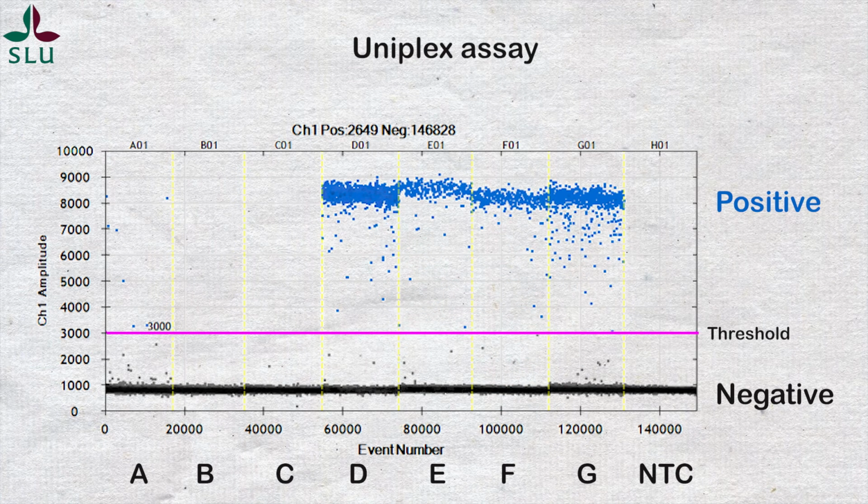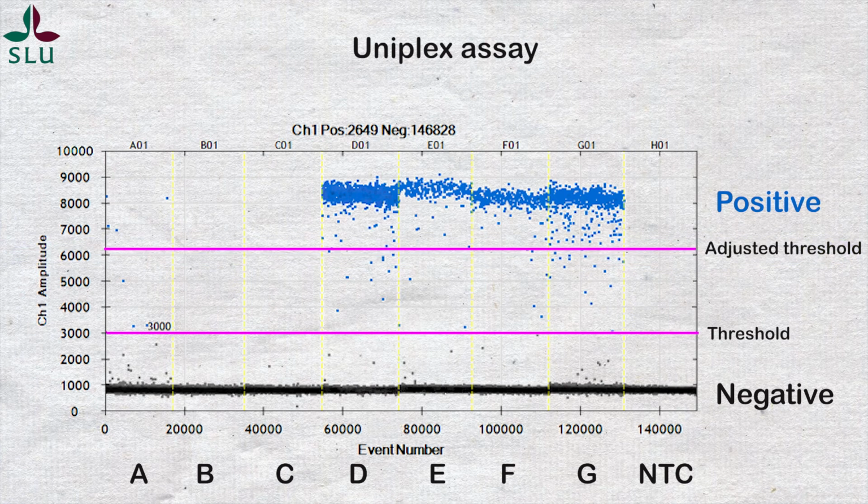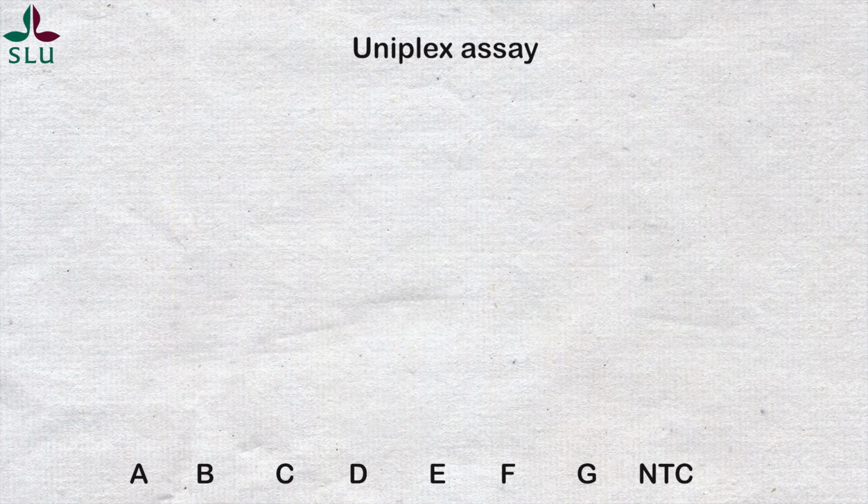In fact, one beauty with ddPCR is that the threshold level in pink can be adjusted. I can assure that in reality it does not affect the outcome so much if the threshold would have been adjusted upwards. Nevertheless, to be sure of the baseline, one piece of advice is to always include a non-template control in every run. This way, it's possible to play with the data and to exclude all data points that represent false positives. Nevertheless, with the original settings in this example, the first 3 samples contain no or very little DNA, whereas samples D to G contain large amounts.